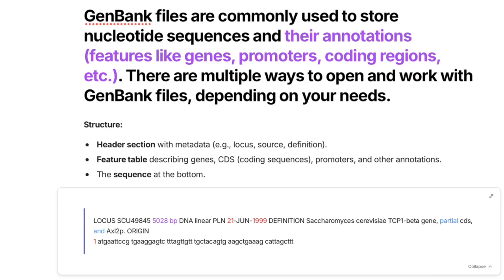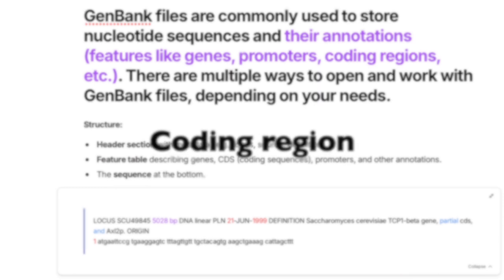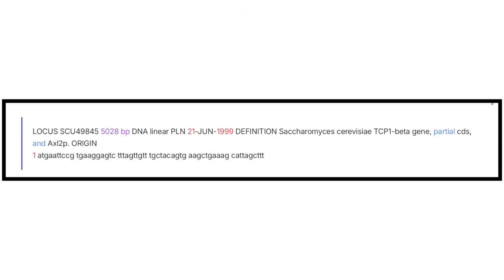Another common file type is the GenBank format. GenBank files are commonly used to store nucleotide sequences along with annotations — features like genes, promoters, and coding regions. The structure includes a header section with metadata such as the locus, source, and definition; a feature table describing genes, coding sequences, promoters, and other annotations; and then the sequence at the bottom. On screen you can see the locus followed by all the additional information encoded in this format.